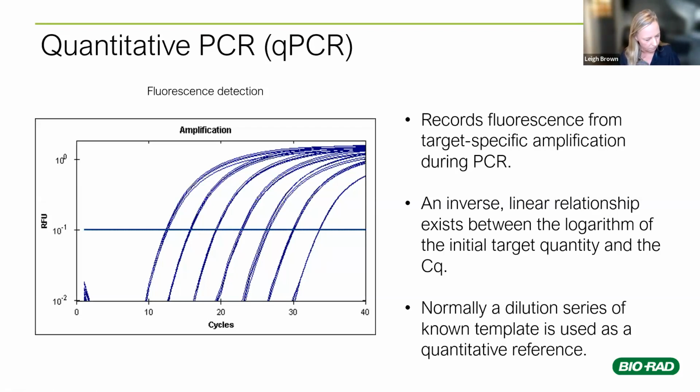What we're looking at here is tenfold dilutions. I'll get more into these amplification curves later, but I think you can probably see here that each of these dilutions, from the most concentrated to the least concentrated over here. The most concentrated, it looks like, was done with 3 or 4 replicates. So if you're looking to really test your students on their pipetting, qPCR is a great way to do that. They have to be really, really precise with their pipetting to get these really nice trace lines that are overlapping like that, and to get them spaced pretty evenly.